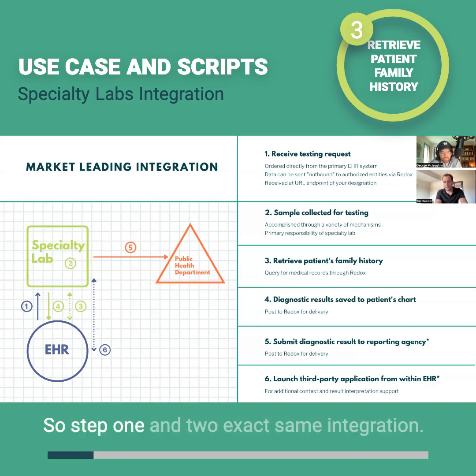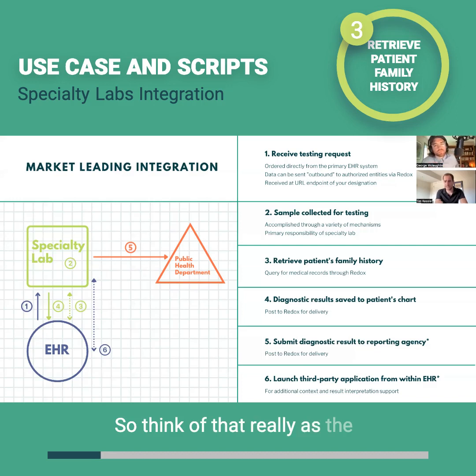So steps 1 and 2, exact same integration. You're going to consume that order from the EHR. That's really going to set off the entire process. So think of that really as the initiating event or the enrolling event. Still going to collect that sample ultimately for testing. But then step 3 is where we look to actually gather additional information.